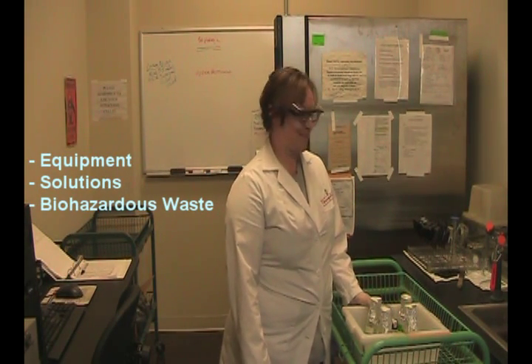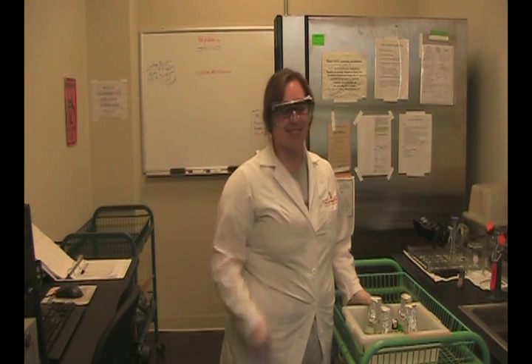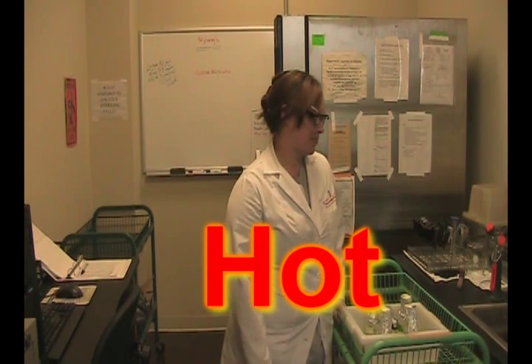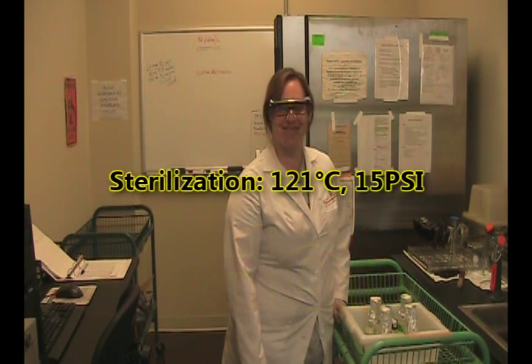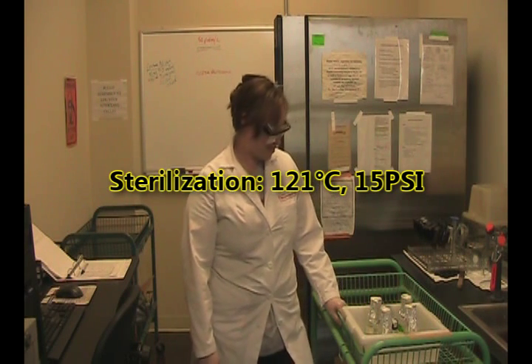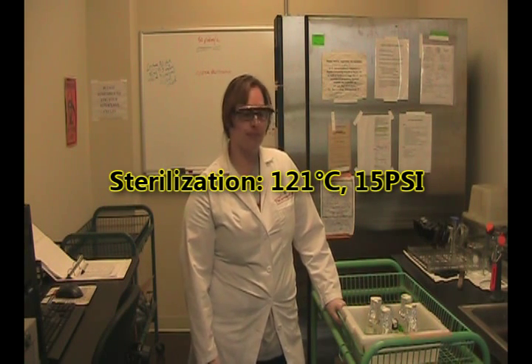Our lovely Tiffany is going to be demonstrating how to turn them on, get them started, and use them. Things to remember: autoclaves are really, really, really hot. Sterilization is done at 121 degrees Celsius and at 15 psi, so it's pressurized.